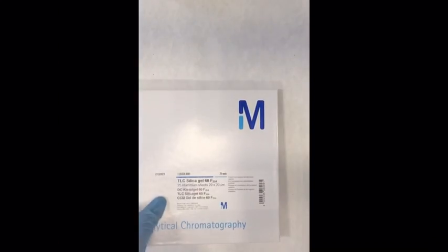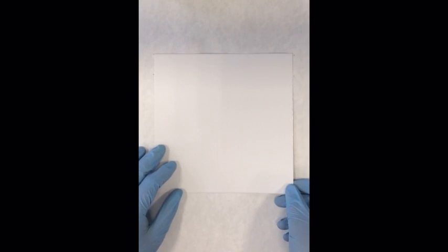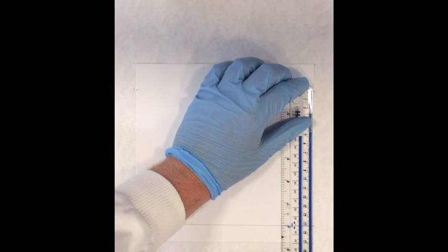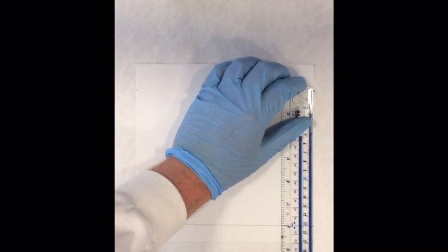Taking your TLC plate, carefully rule out the dimensions of the plate. The baseline should be 2 centimeters from the bottom of the plate and the developing distance should be 10 centimeters from the bottom of the baseline. These are the standard distances according to the British Pharmacopeia.